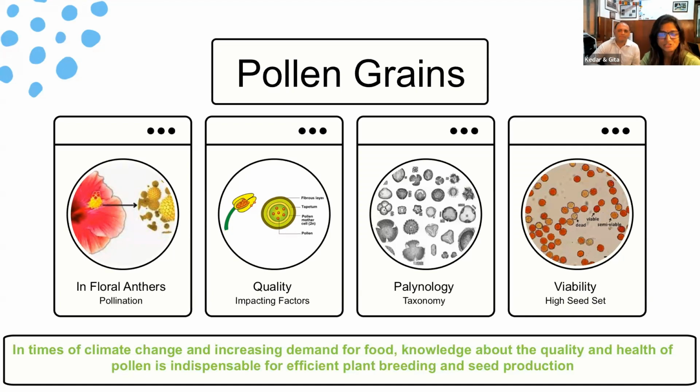Palynology, as Olivia just told you during our introduction, is the study of pollen, and you see several pollen on the screen as well. It's critical. Basically, it can answer a huge number of questions ranging from botanical, ethnological, geological, etc. But recent work, as I told you, allowed us to reveal the importance of pollen viability as well in invasives, right? So that is where we got on and then said, all right, so what does the DHM show us?